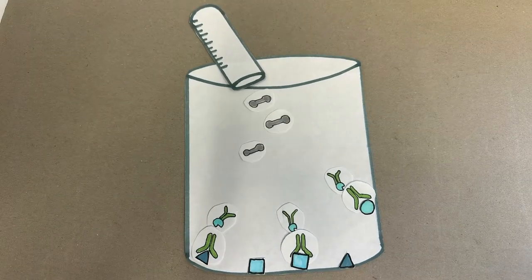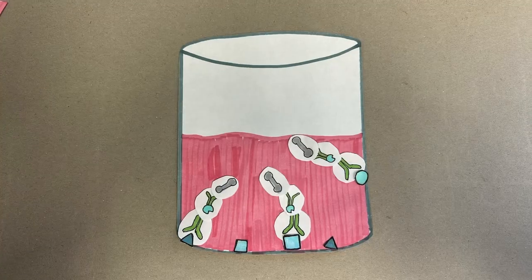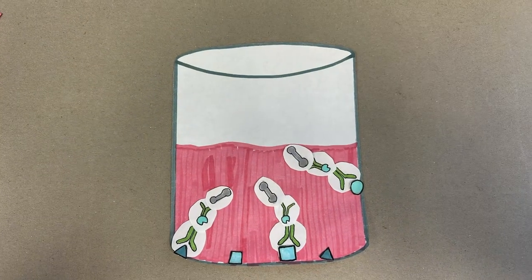A substrate is added which reacts with the enzyme if present, producing a color change in the sample. This indicates the presence of the target antigen.